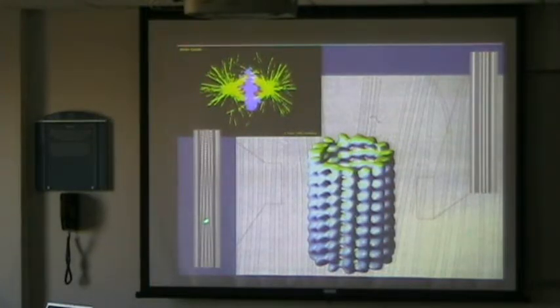And they're sort of super twisted. You see here, then you get this kind of moiré. So these protofilaments are not going exactly straight anymore. They actually do a bit of a twist. And that gives you this distinct moiré feature. So that's the way you can actually identify them. You can go to a micrograph and look at them. Okay, this is the right one we want.